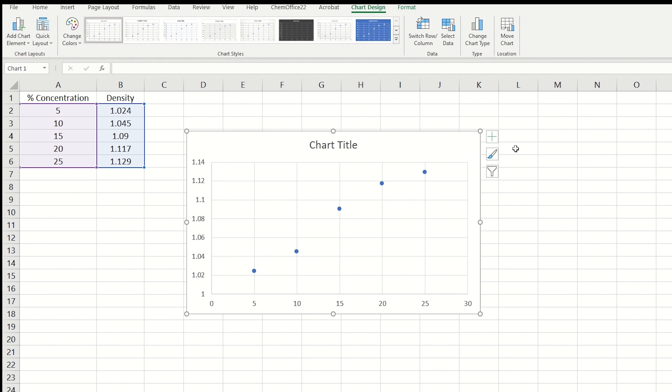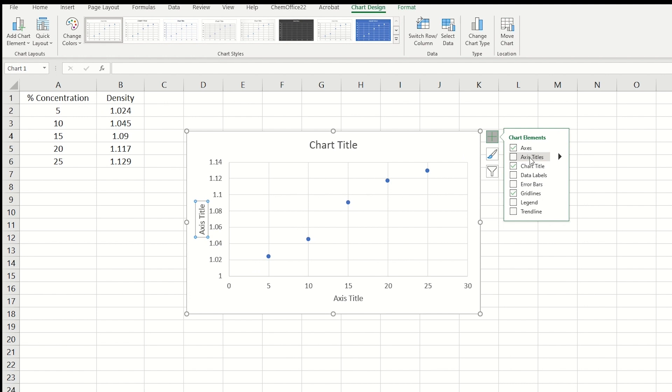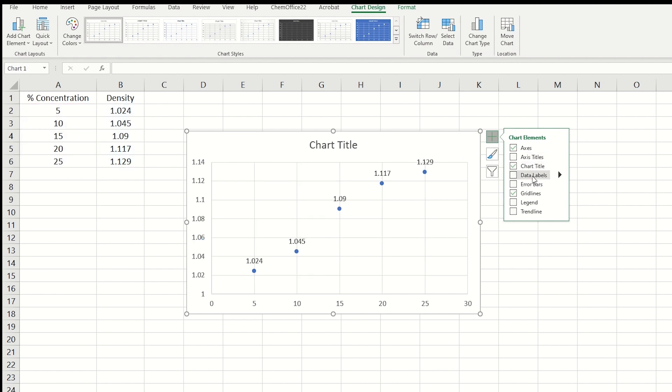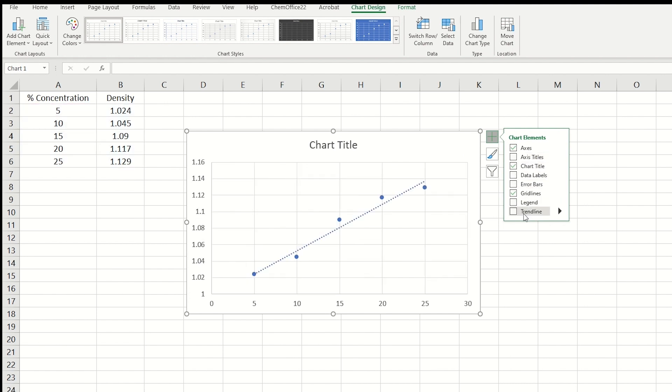You can click the plus icon on the top right corner, and there are several options that appear, adding the axis titles, the chart title, data labels, and trendline. Clicking this box will give you the best fit line of the data.